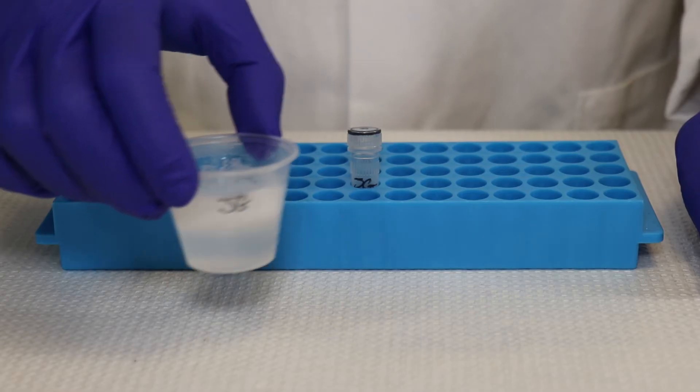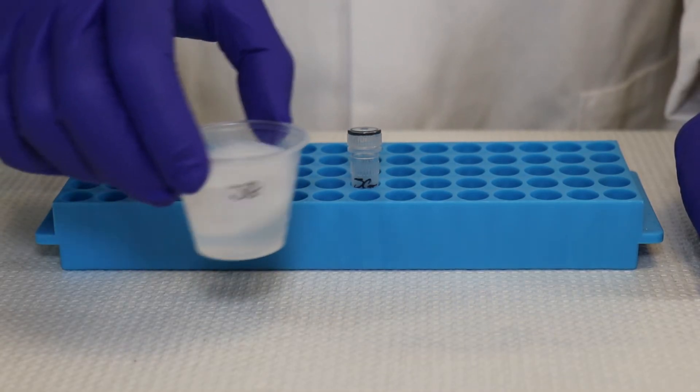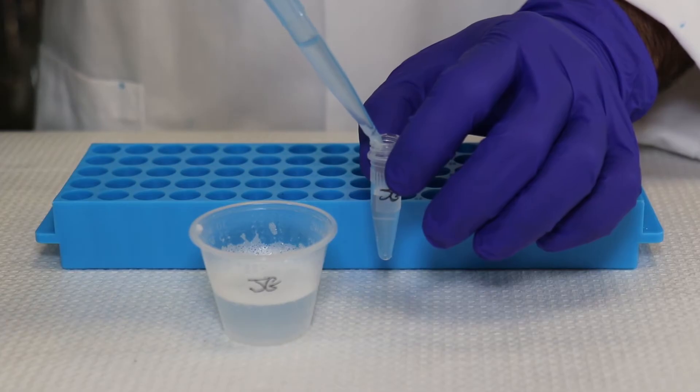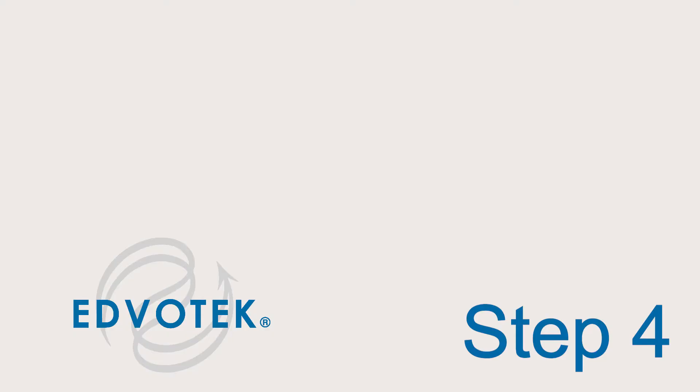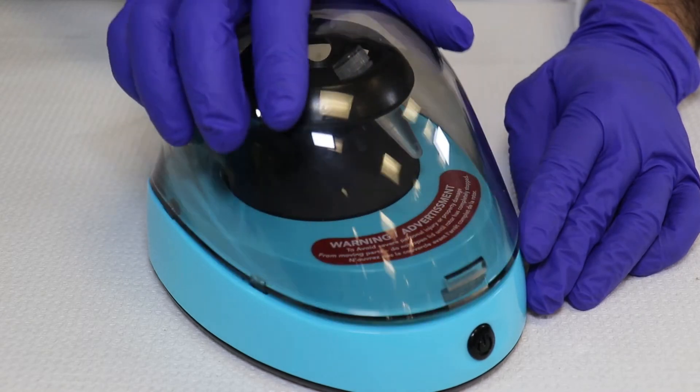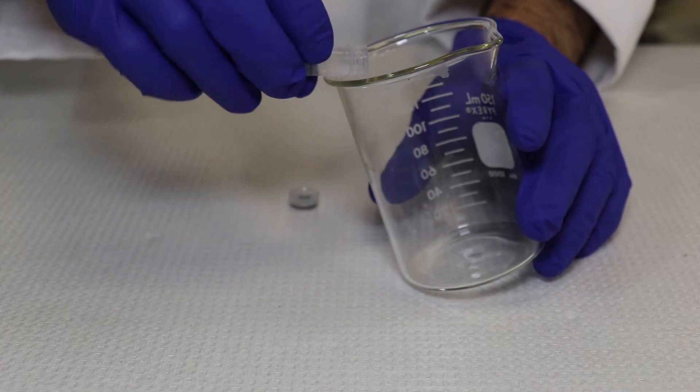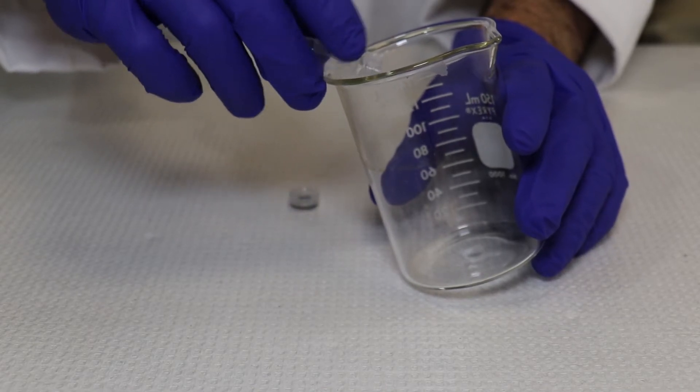Expel this solution back into the same cup. Step 3: Swirl the cup gently to resuspend the cells. Transfer 1.5 milliliters of the cell solution into the screw cap tube with your initials. Step 4: Centrifuge the cell suspension for 2 minutes at full speed to pellet the cells. Pour off the supernatant but be sure not to disturb the pellet.